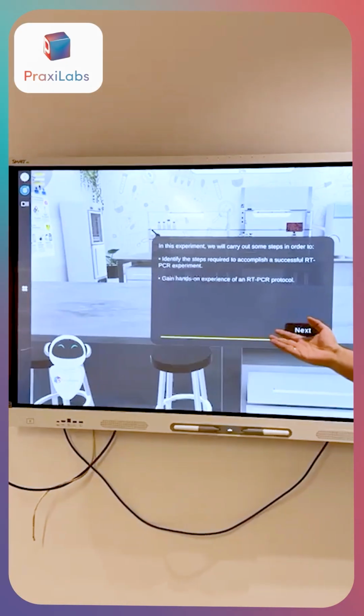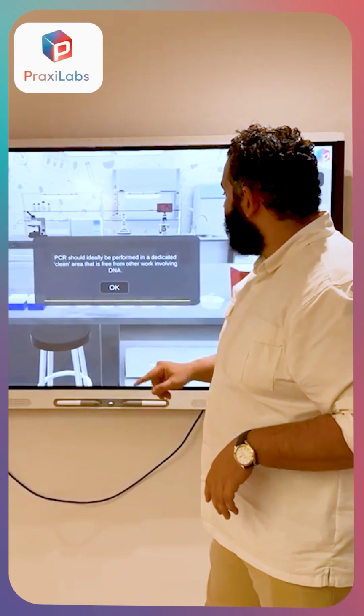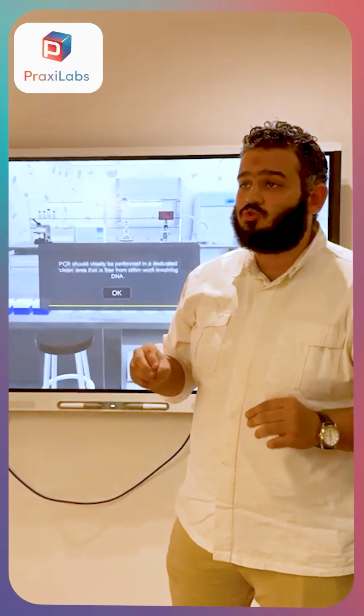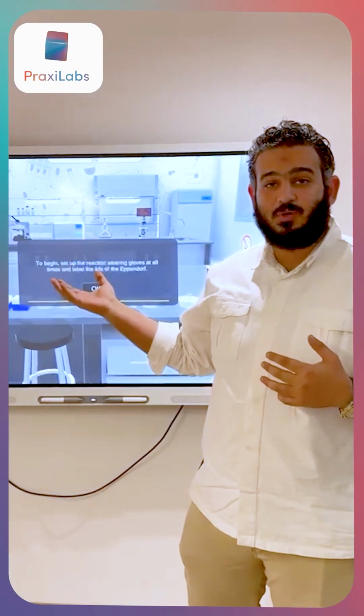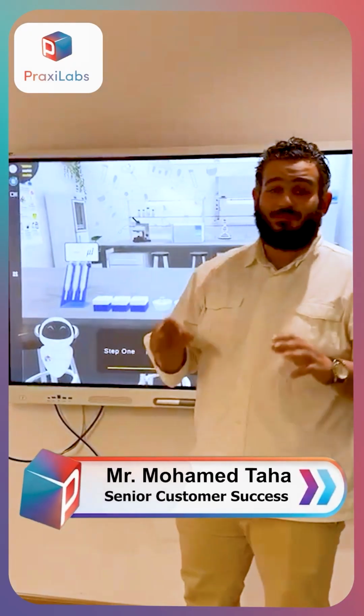And here, before starting any experiment, you can see the learning outcomes. So we click next, and these are some messages that help students know what to do before any experiment. Here it told me I have to perform the PCR experiment in a clean environment free from DNA. Also, you have to wear your gloves, but now I'm performing the experiment virtually, so no need for the gloves. I will click OK, and now I'm going to prepare the master mix.